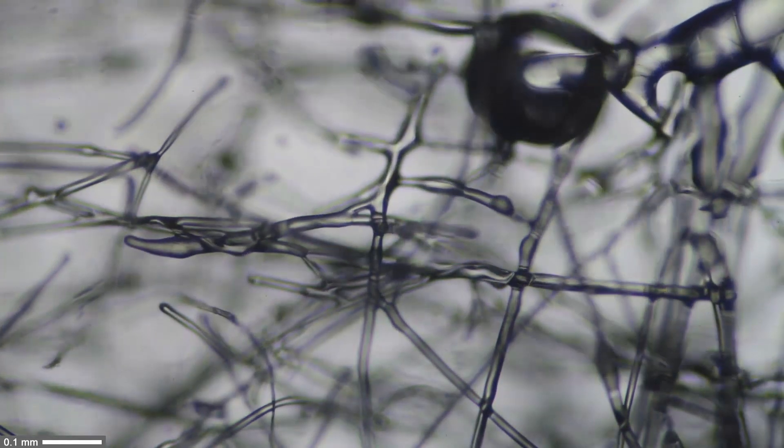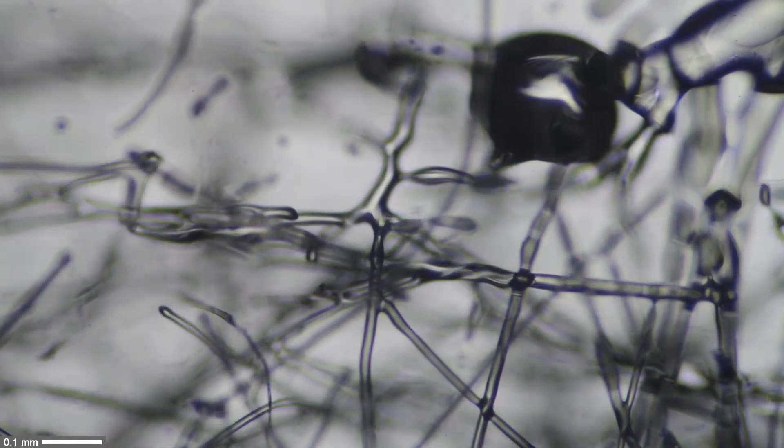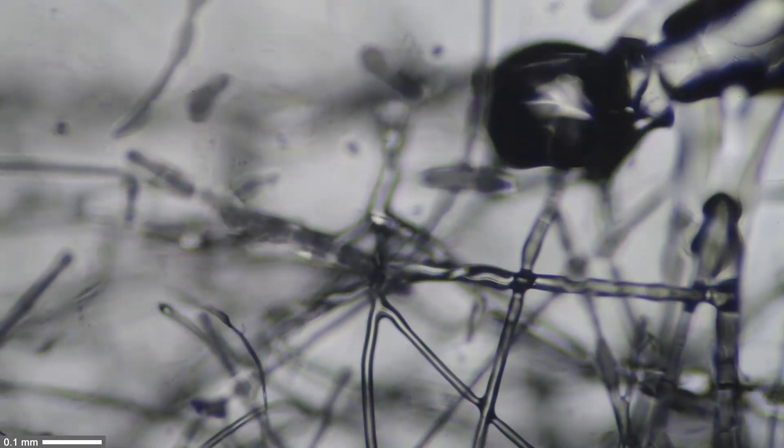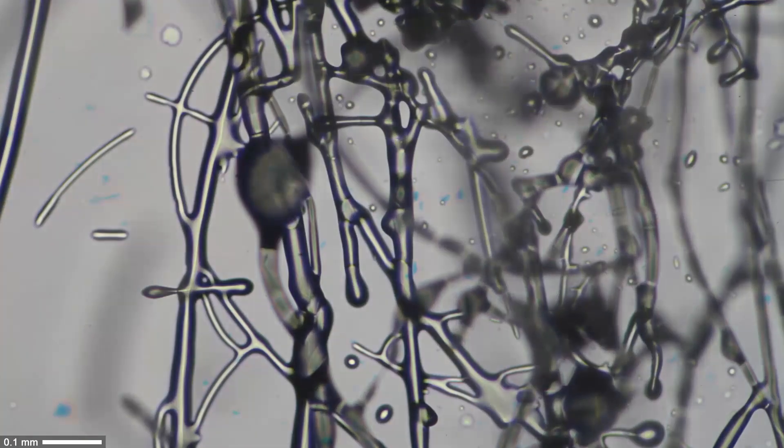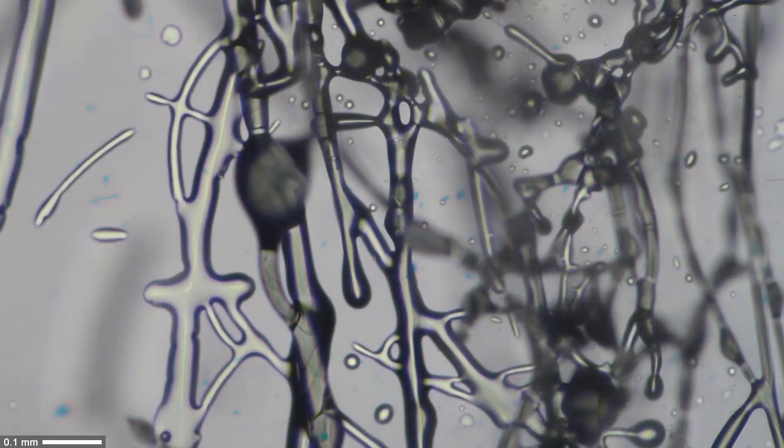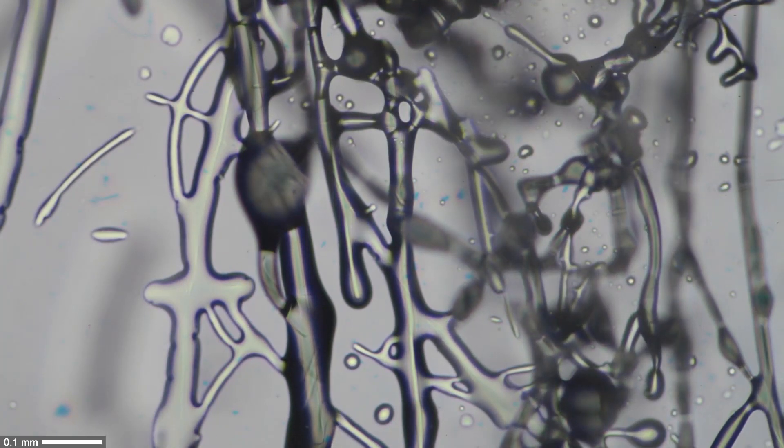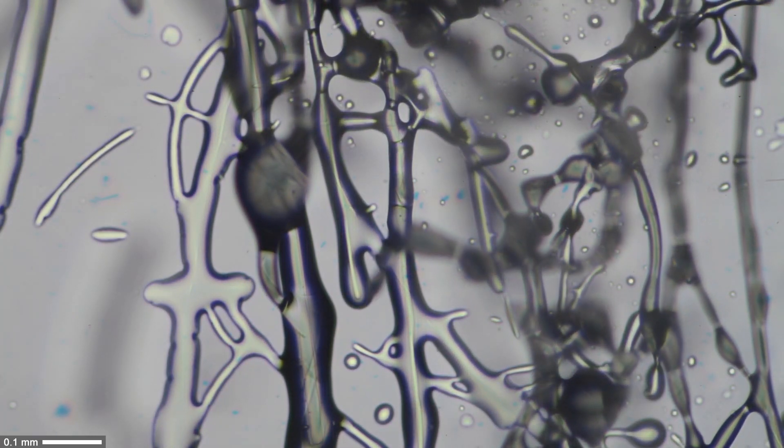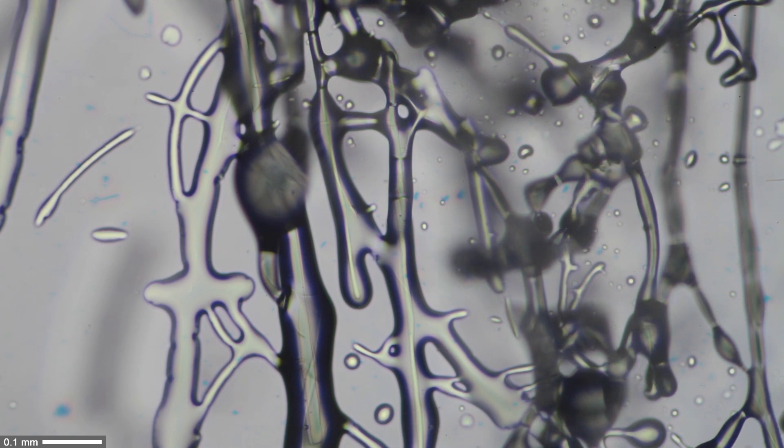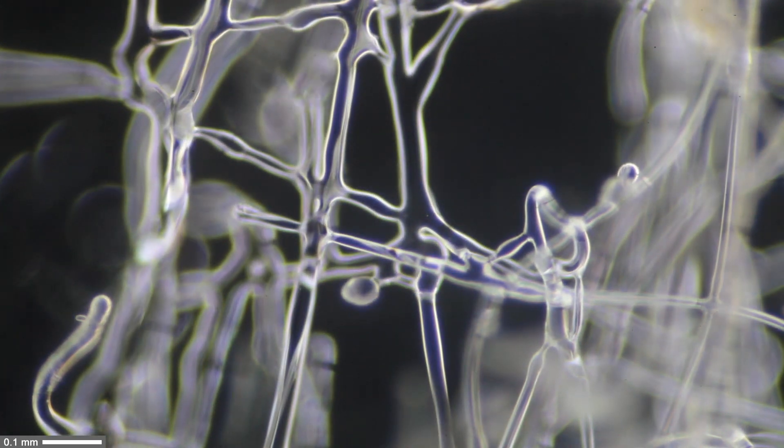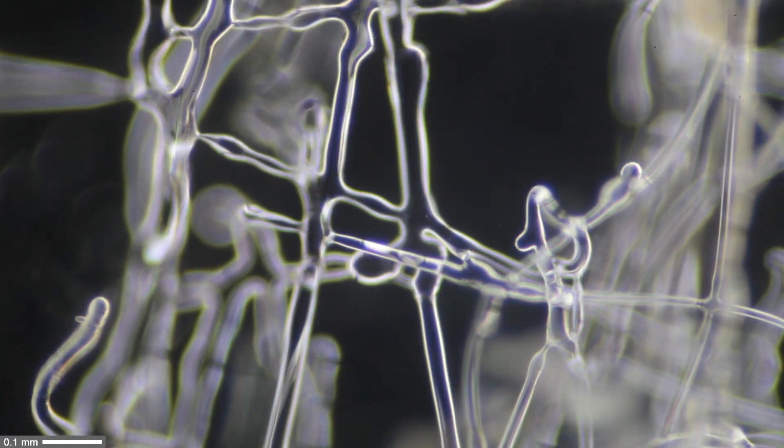That's time lapse, so I was speeding up everything. You can see that the individual cotton candy fibers start to absorb the moisture and melt. When I say it melts, it actually means the sugar structure disintegrates—it's not melting because of heat.